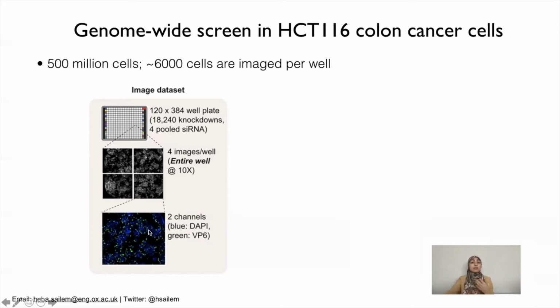This gives us a lot of information that we can use to learn not only about the phenotypes at the single cell level, but also at different levels. For example, changes in the spatial distribution or the arrangement of cells, etc.